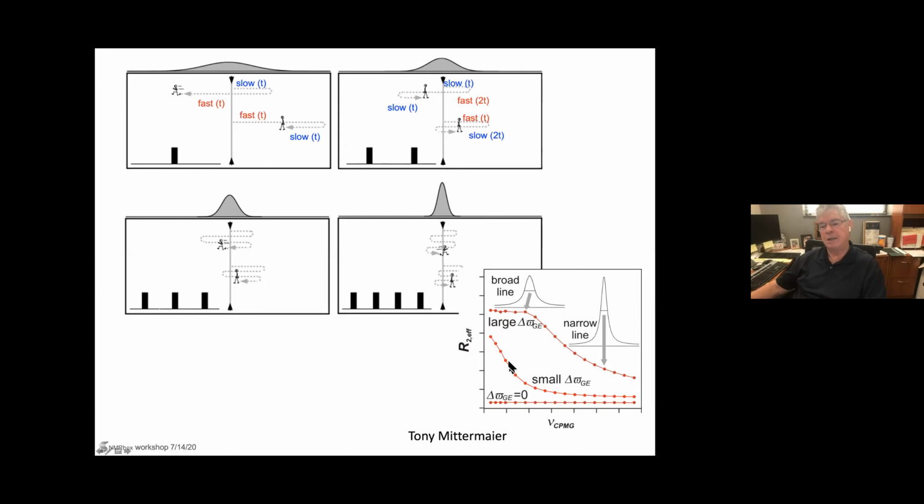And what you see are the so-called relaxation dispersion curves, okay? If you have a large delta omega, a very significant difference in the speed of the runners, you get a big effect, and you see this. If you have a very small chemical shift difference, you see this kind of dispersion. And if there's no difference, if they're coherent, they have the same rate, then there's no change. This case is the same as the fastest case, and it's flat in this dispersion.